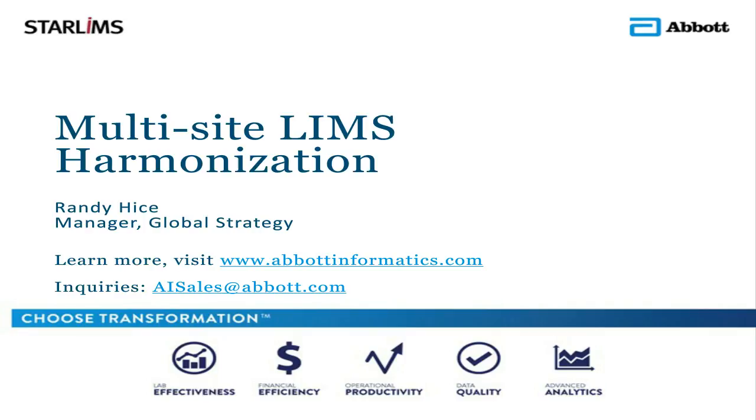Now, if we're talking specifically about things like 21 CFR 11 or something like that, you're talking about tools that are available to accommodate those regulations, such as electronic signatures, such as audit trails and those kinds of things. But how you actually show how the audit trails are being monitored, how you are actually showing how the electronic signatures are being applied, those are all part of your master validation plan and part of your validation scripts and testing. At the end of the day, there's no such thing as a validated system that is sold by a vendor.